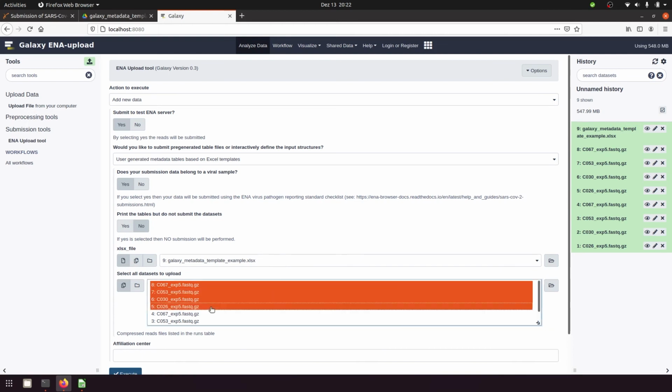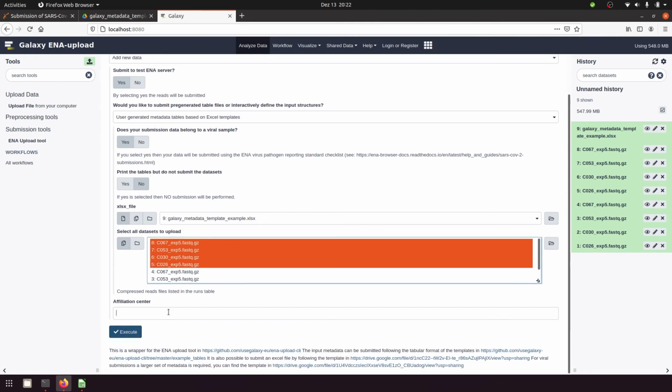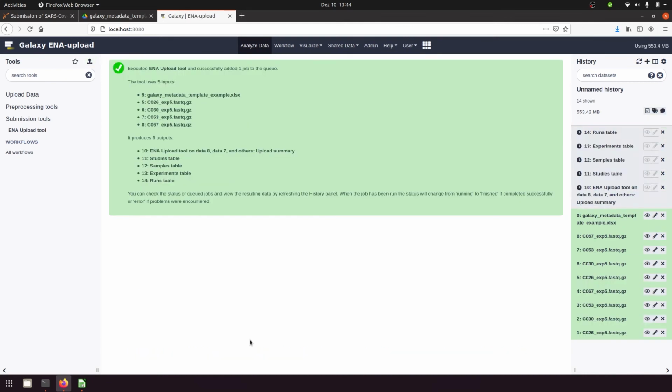We select the datasets that we want to submit. Make sure that you take the ones where human reads were removed. These are normally the top ones in the list. Finally, provide the affiliation center for which the submission is done. Click Execute. This step is fast-forwarded in this video.